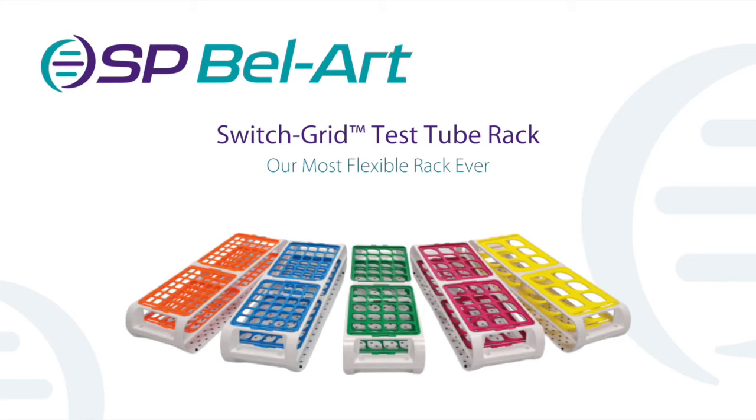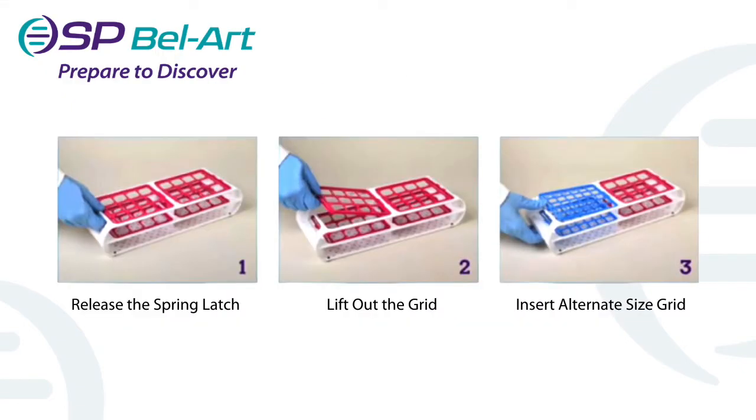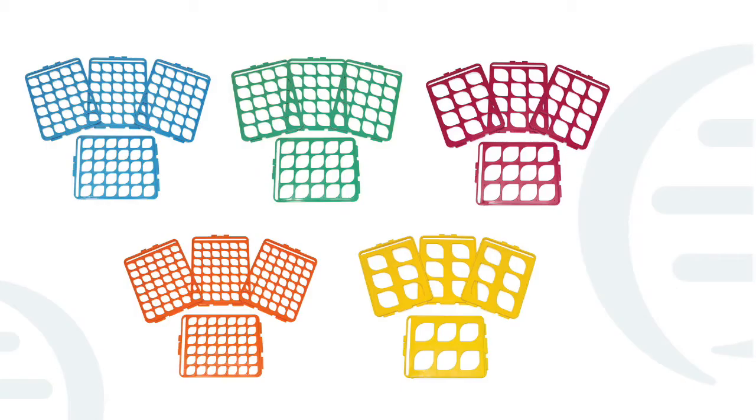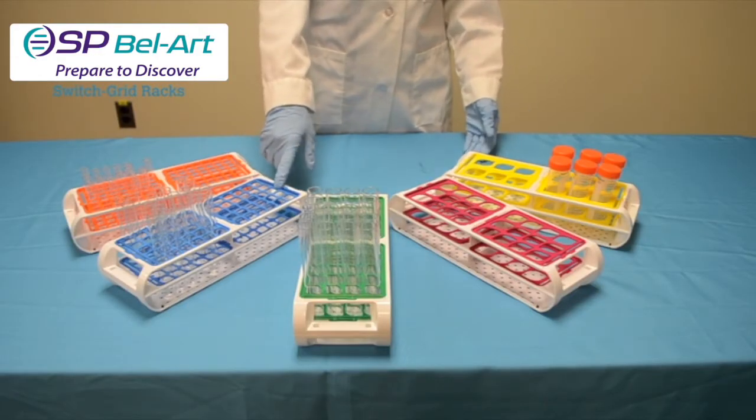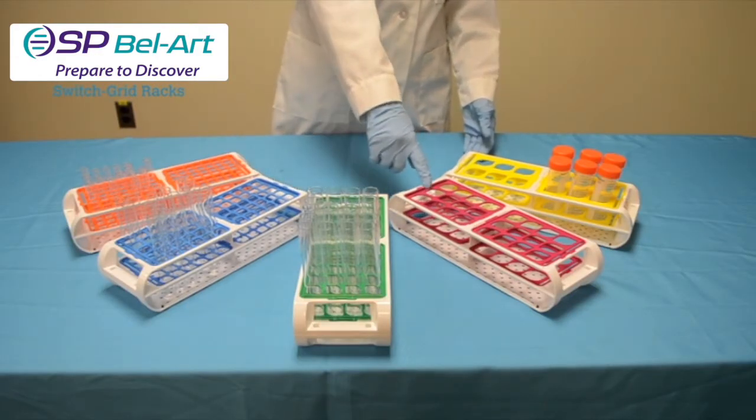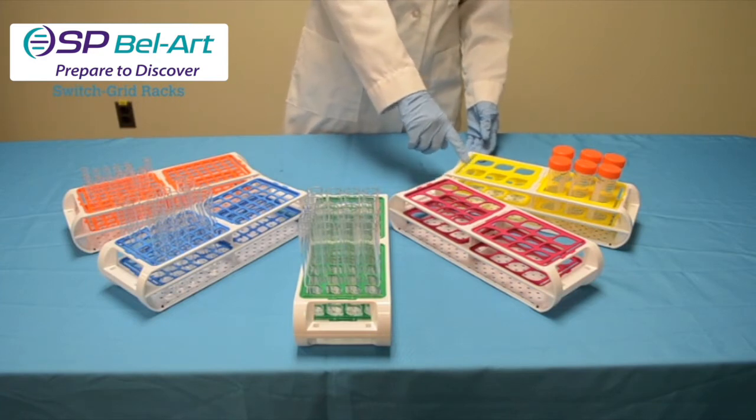Our switch grid racks are double-sided racks that hold up to two different size tubes in the same rack and allow users to quickly switch grids to hold other sizes as needed. Each of the five color-coded grids corresponds to a specific test tube size including 13 millimeter, 16 millimeter, 20 millimeter, 25 millimeter, and 30 millimeter tubes.